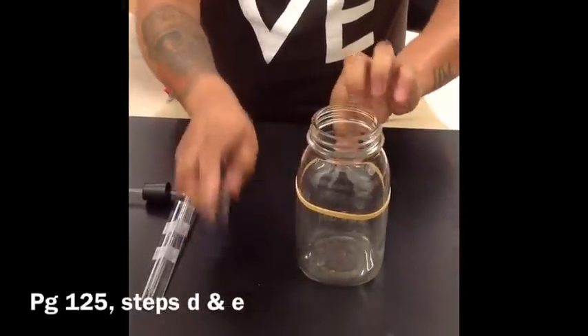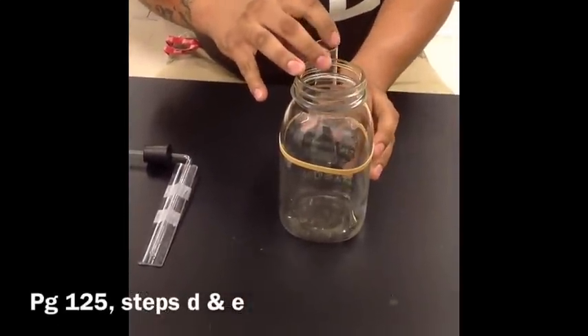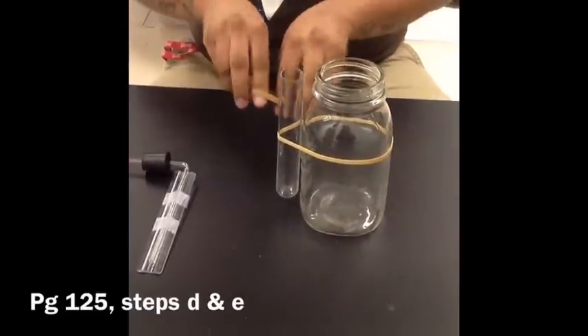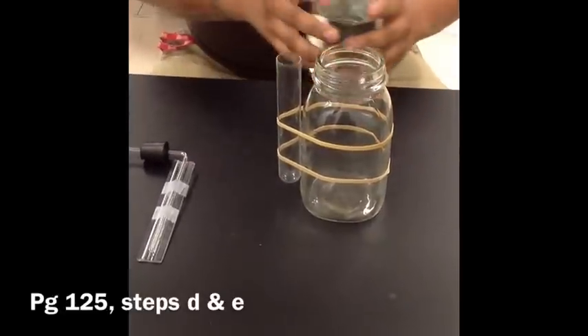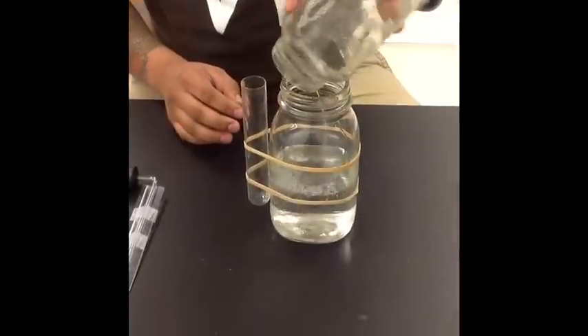Use two rubber bands to attach the top and bottom of the large test tube to the outside of a jar or drinking glass. This will securely hold the test tube in an upright position and make it easier to record changes in the glass tubing. If needed, pour tap water into the glass for stability.